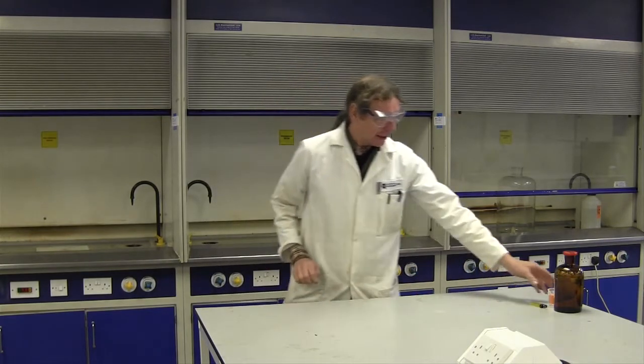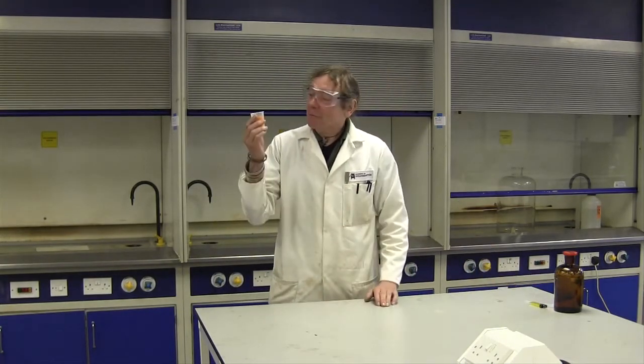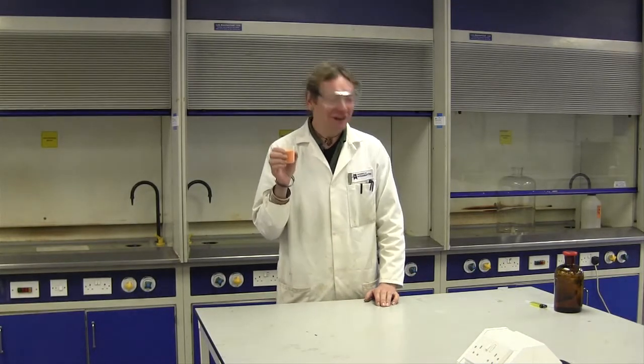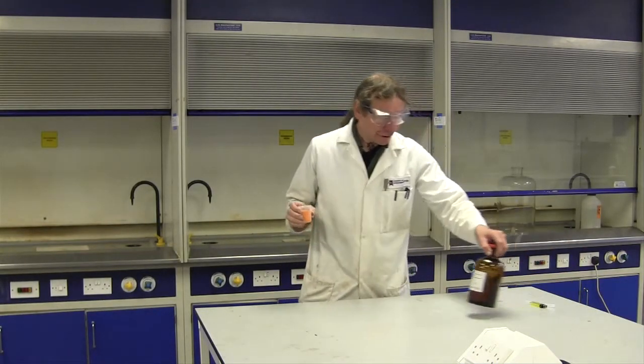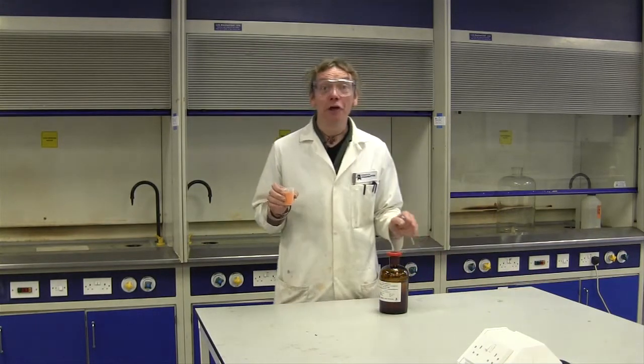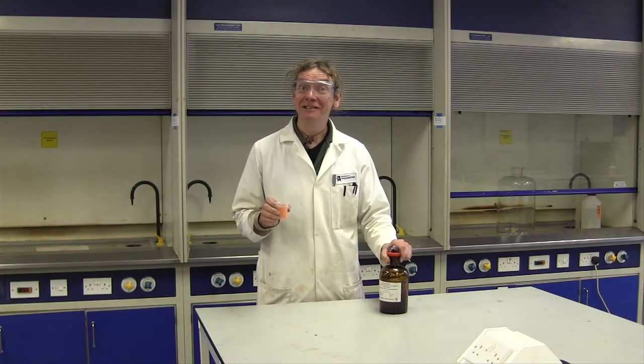Will it fizz or will it bang? I've got here some Ammonium Dichromate, nice orangey colour. I'm going to add a couple of drops of acetone and then I'm going to set the whole thing on fire and we'll see what it does.